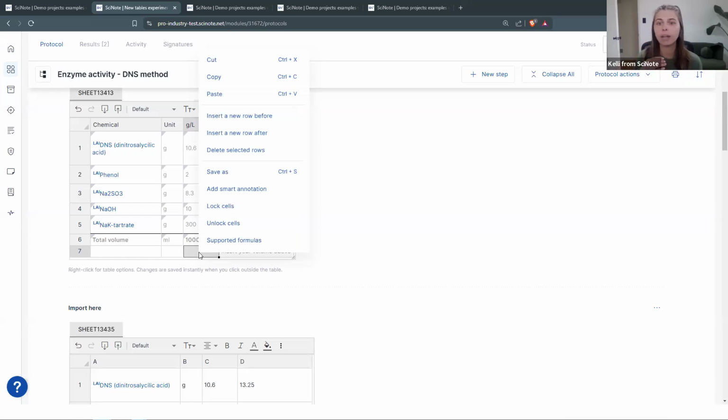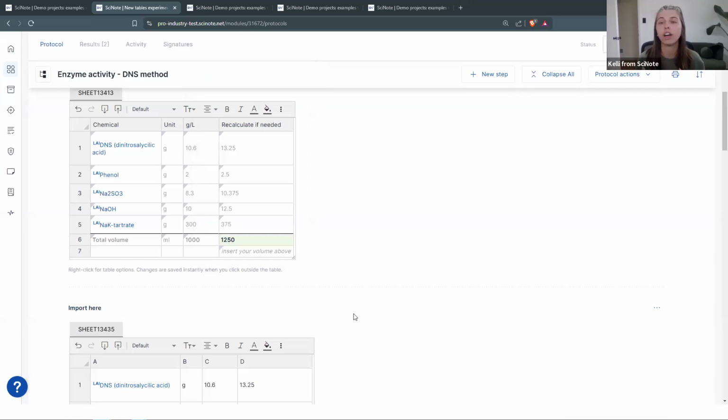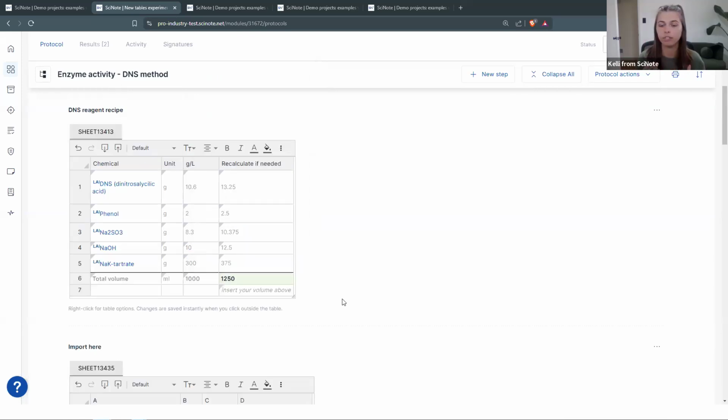It is an Excel document, so once you download it, if you click to edit it, you won't change the file itself, but it'll allow you to filter down and search for the formulas that you are looking for specifically. So we hope that that helps. If you find that the file that we've created is not helpful, also let us know so that we can improve it for ease of use.